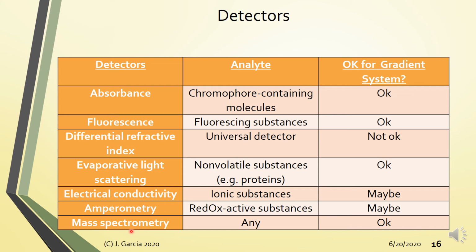Now, another important thing to consider is whether the detector is okay for a gradient system. Alright? Not all detectors are compatible with gradient elution. So, you need to take note of this listing here.